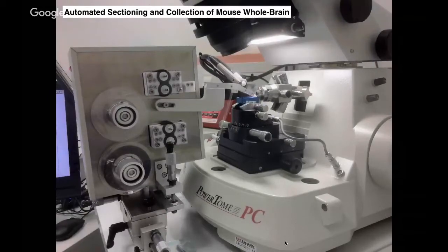So this Atumtome, it's this box on the left-hand side. This was based on a design that Ken Hayworth developed some years back in Jeff Lichtman's group at Harvard. And they've been developing this technique extensively. What it is basically is a conveyor belt for picking up sections that are produced automatically from a commercial ultramicrotome, which is shown on the right-hand side.